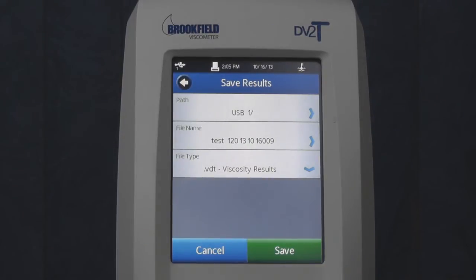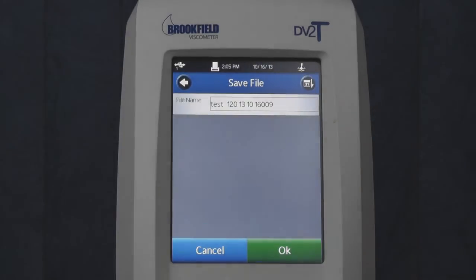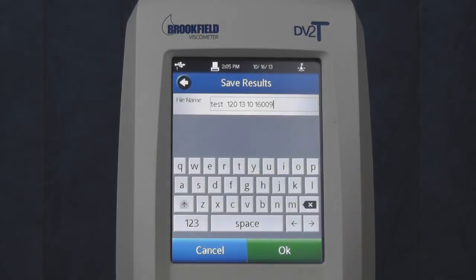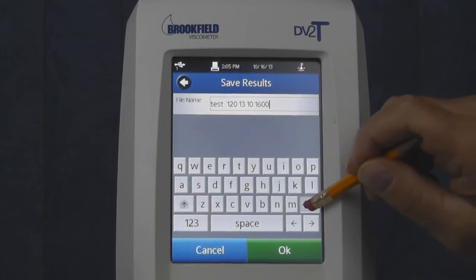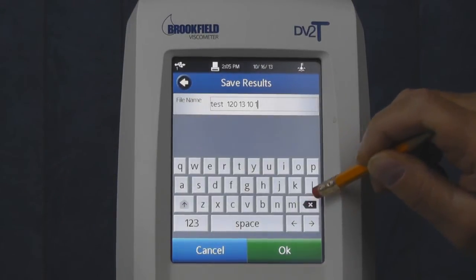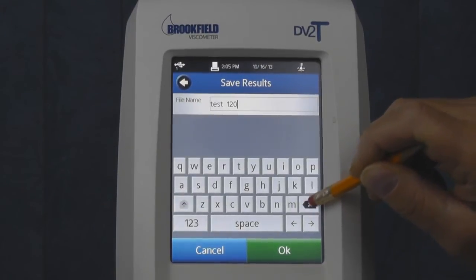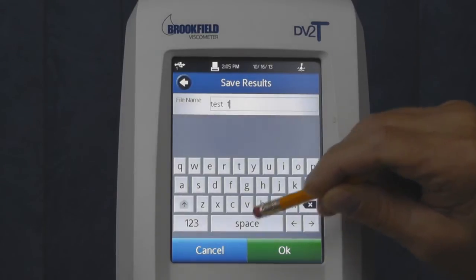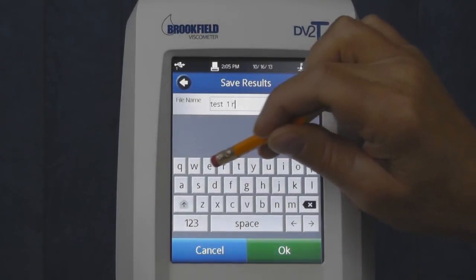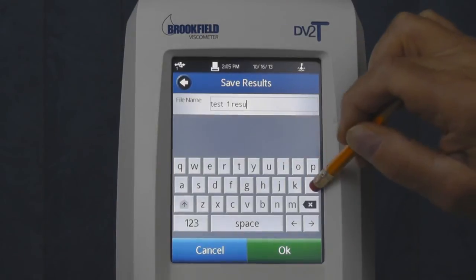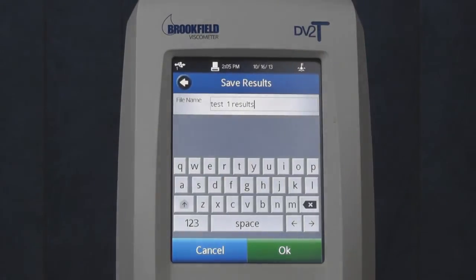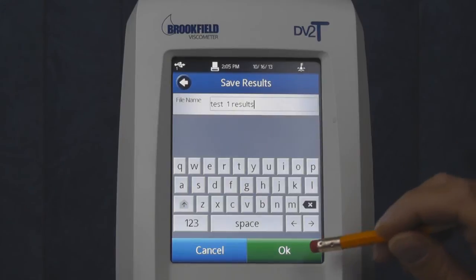You can use the existing file name, or to create a new file name, touch the file name box and then touch the default date code name. Backspace to delete unwanted characters and enter your new file name and touch OK.